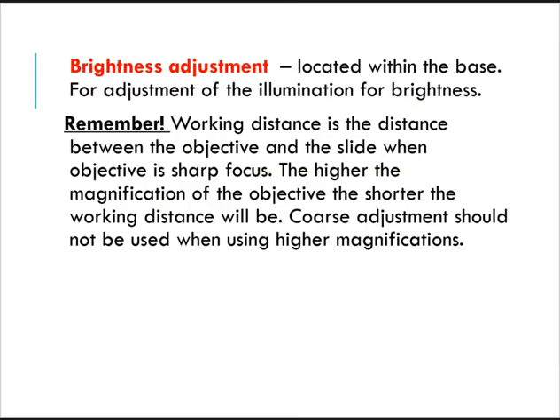Now let's check the next part of your microscope. We have your brightness adjustment. It is located within the base. This is just for adjustment of the illumination for your brightness.